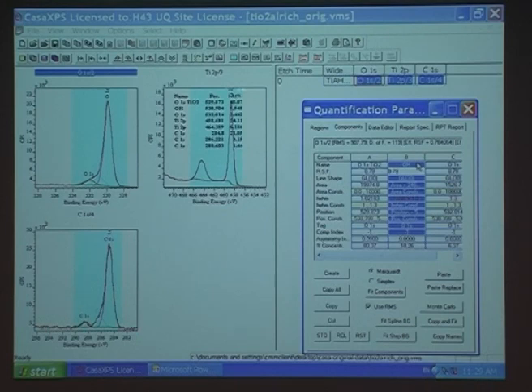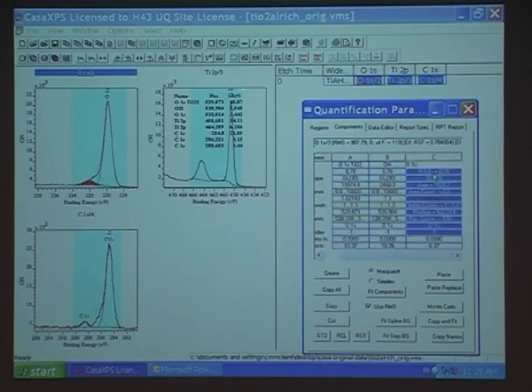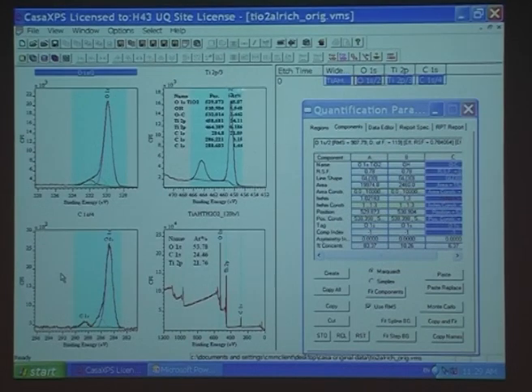And the other one, it's 530. What's the next oxygen coming in at 532? Oh, I'm not so sure. That's probably an oxygen from the organics. Again, having the carbon there that's rather strong is creating a little problem with the balance. But it's certainly helping us with getting an accurate binding energy. And again, I just then put this one on here, and that's a complete data processing of that.